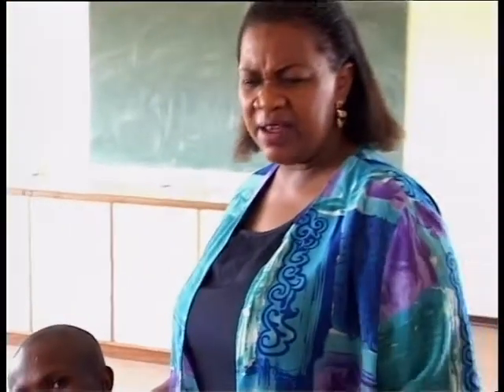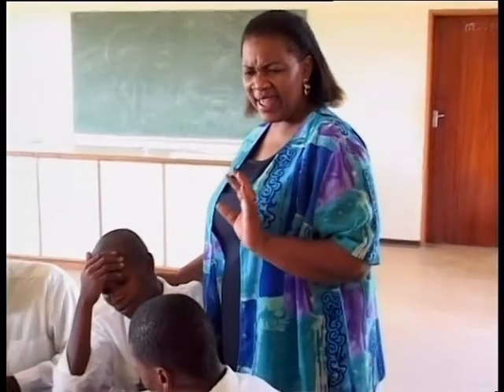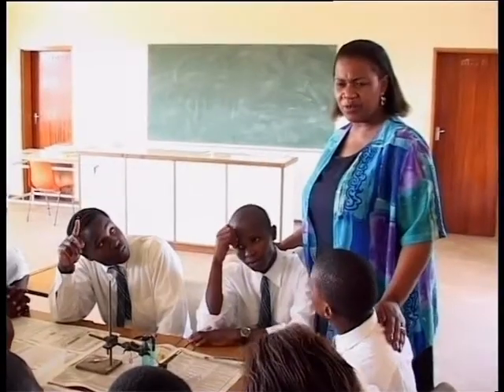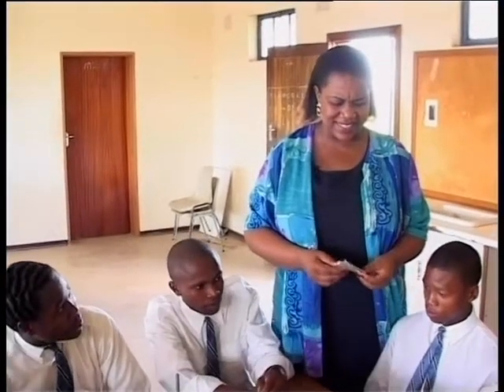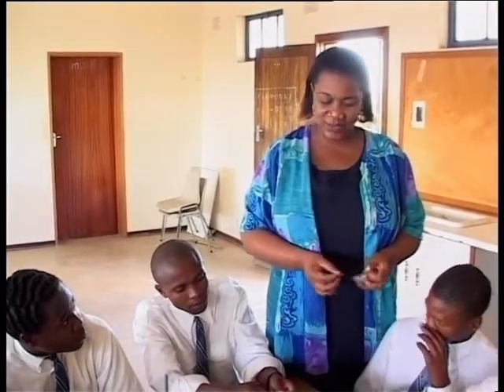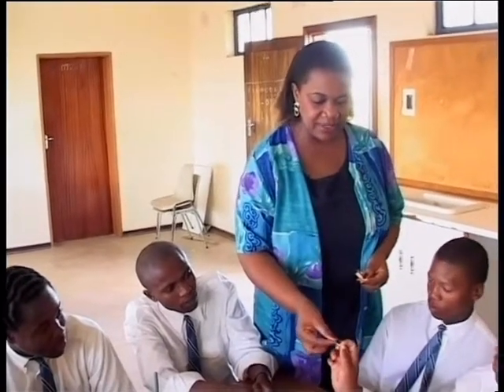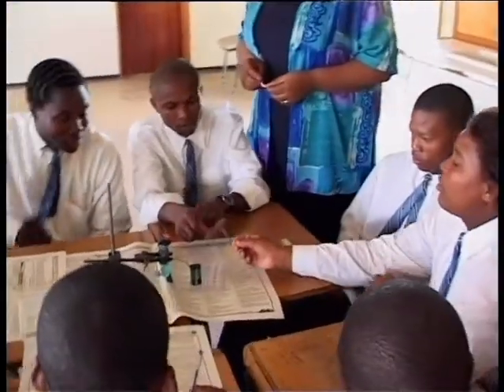Okay, people, in our everyday life, where have you ever seen chlorine being used? What do we use chlorine for? I think we use chlorine for bleaching. Okay, we use chlorine for bleaching, and there's one other important use of chlorine in everyday life. We use it as a cleaning agent. For instance, we use it to clean swimming pools. Can you just put this strip onto the side which we think has chlorine and see what the effect of that chlorine will be on that strip of paper?